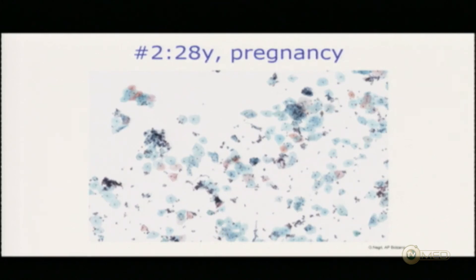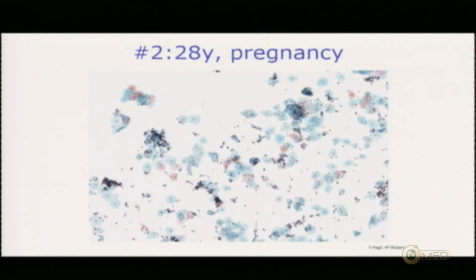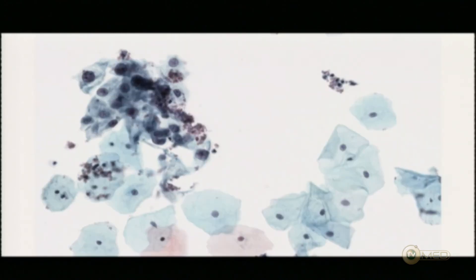So we have a similar situation again — it's a pregnancy. That is really particular. The woman is 28 years old. And this is a low magnification view. You can see it's actually a relatively clean pap test. There are just a few leukocytes, and then you have those cells. If you look at higher magnification, we find those cells. And at even higher magnification, we find this.